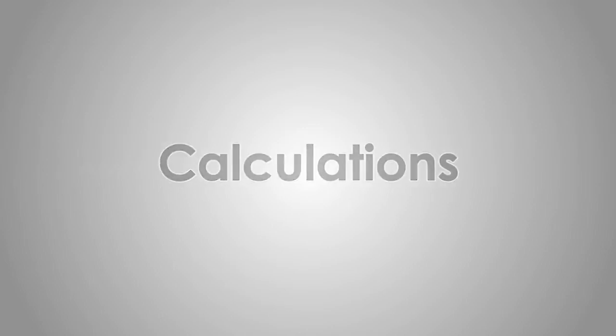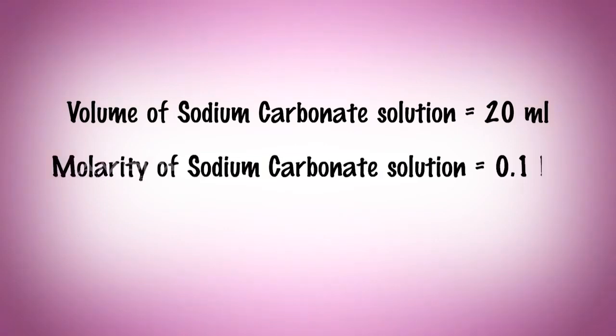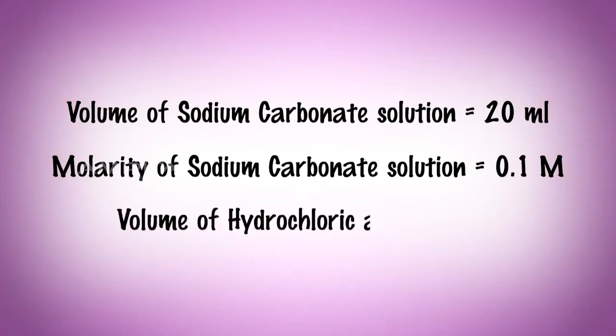Calculations. Volume of sodium carbonate solution is equal to 20 ml. Molarity of sodium carbonate solution is equal to 0.1 molar. Volume of hydrochloric acid is equal to 38 ml.